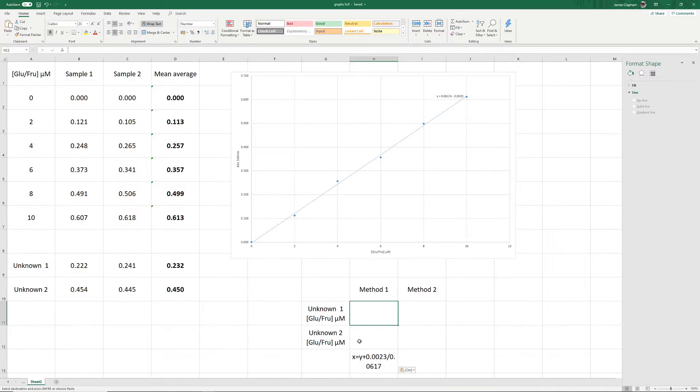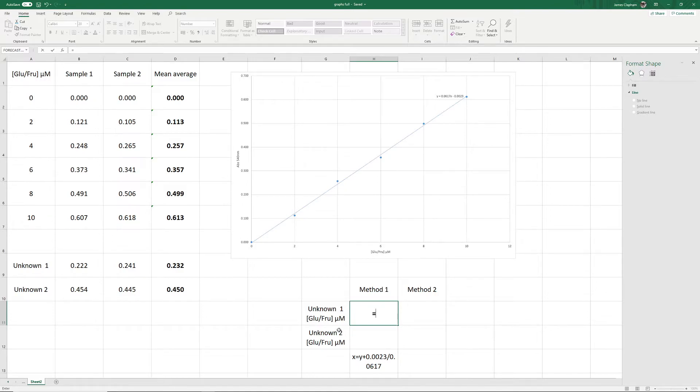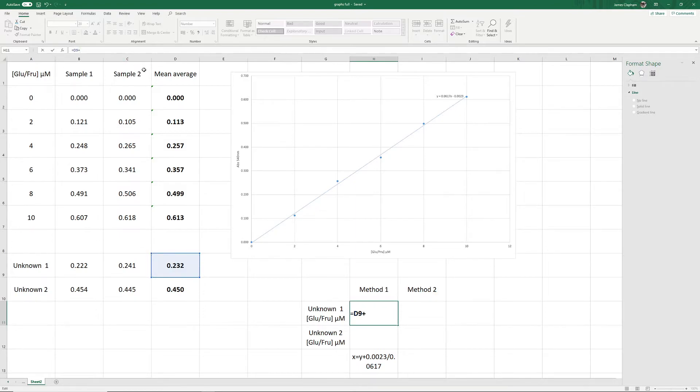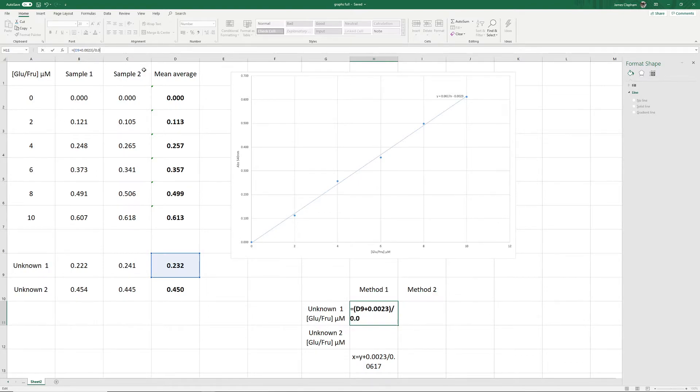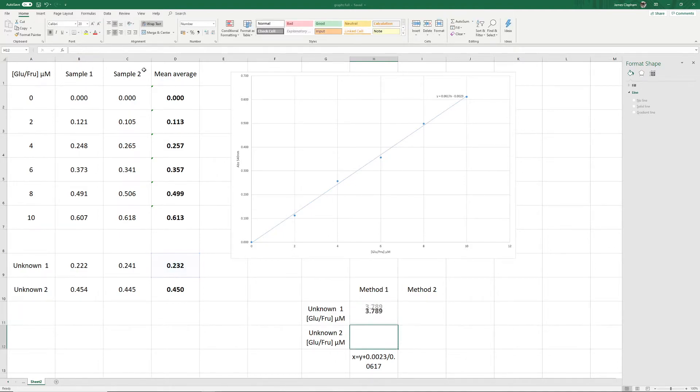In our first cell here, we're going to type equals to show Excel that we want to write a formula. We select our y, which is this value here. Then we do plus 0.0023, and we're going to put that in brackets to make sure that this part of the calculation is done first. Then we're going to divide that by 0.0617, and we get a value of 3.789.